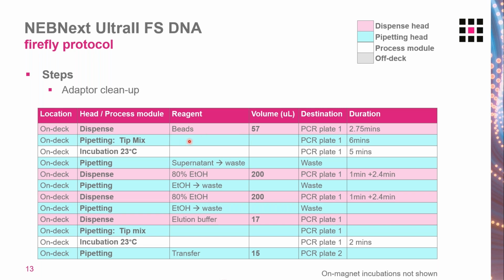We aspirate and dispense about 75% of the well volume. We aspirate from the bottom of the well, dispense towards the top of the well, and we perform 50 mix cycles. This gives a really good thorough mix. It's been well tested.